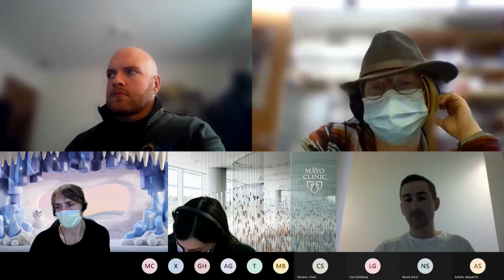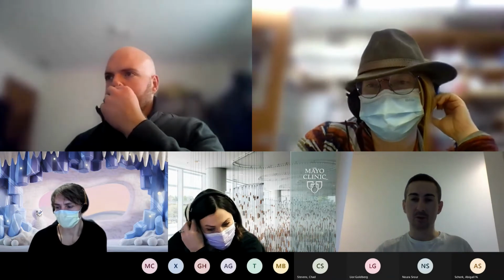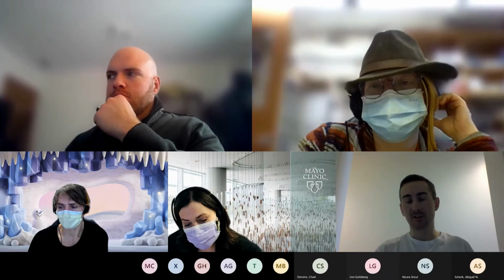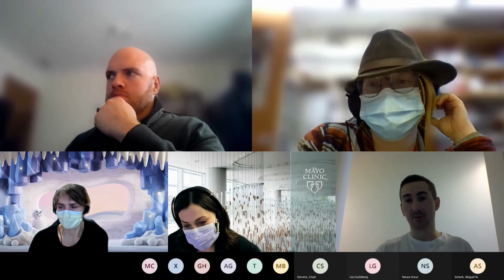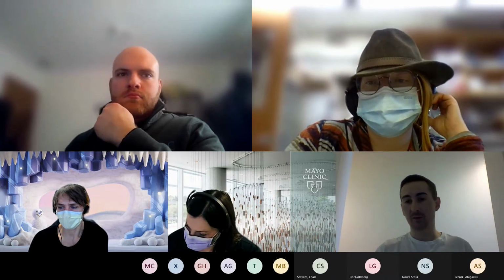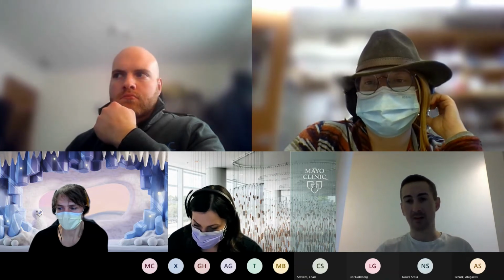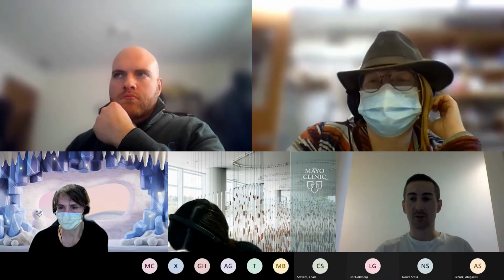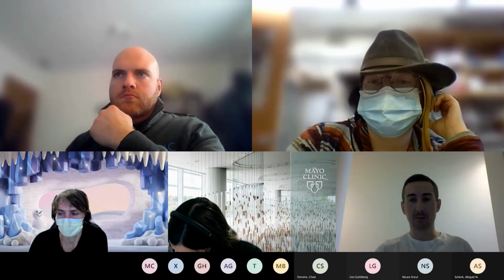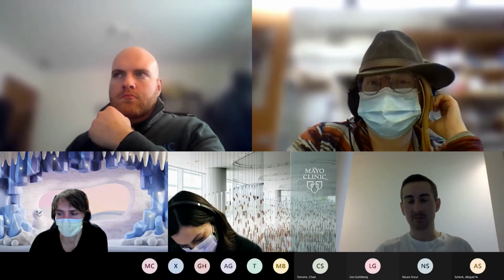Yeah, I think that's potentially worth looking at. There was no DMSO in our samples. We just added the lyse fix buffer to the stained samples, and then we put those fixed samples straight into storage at either 4 degrees or -20. So there was no DMSO added to those, but it might be worth giving it a try and seeing if we can improve things.